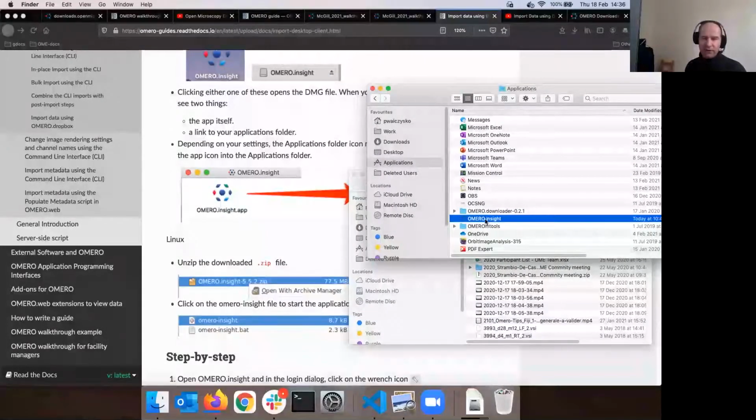Now, I guess there were plenty of thumbs up saying that I'm actually boring you right now with the install because you managed to do that already. So if you are not the case and you are drowning in the install, then you bombard Will more in the chat, and I will just try to start it.